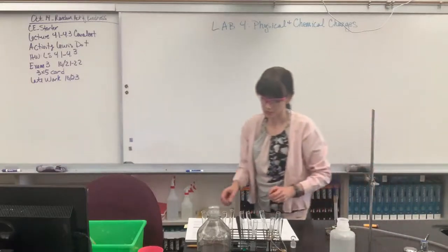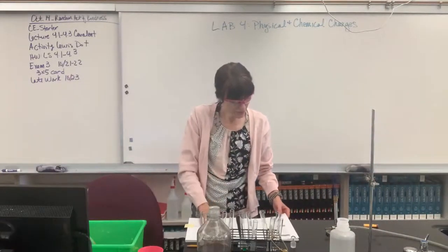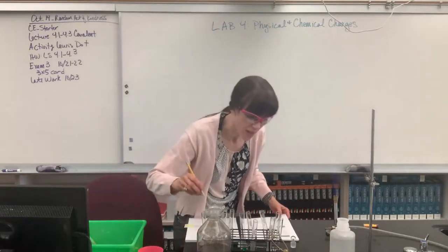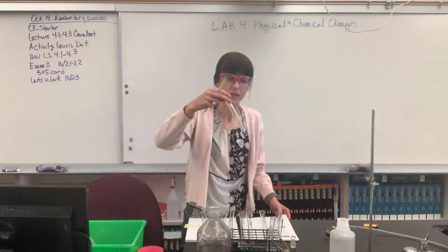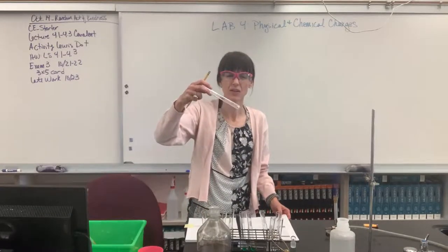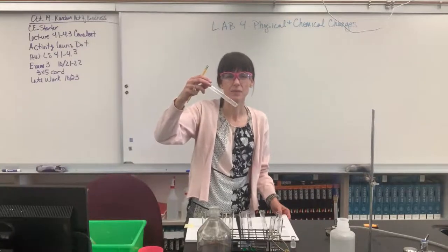Well, let's see what we need to record on this. It says result of adding HCl. So the result is there was a reaction and it evolved gas.